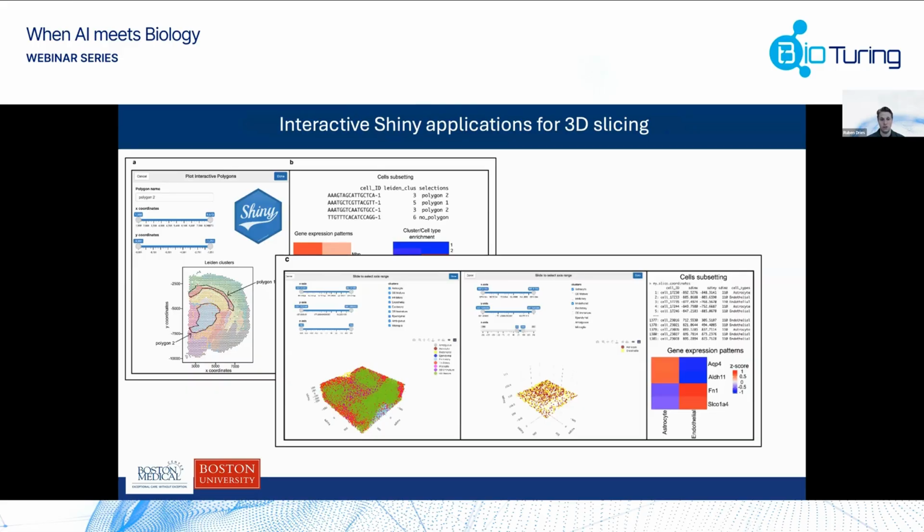For example, if you have 3D data, we have a way to slice the data. We actually have some really cool 3D slicing tools that not a lot of people know about. Or maybe they know, there are just not a lot of people with 3D data. But with 3D data, you can all of a sudden slice your data in different directions and create in silico 2D sections of your data sets, which I think is pretty cool. And we have that available.